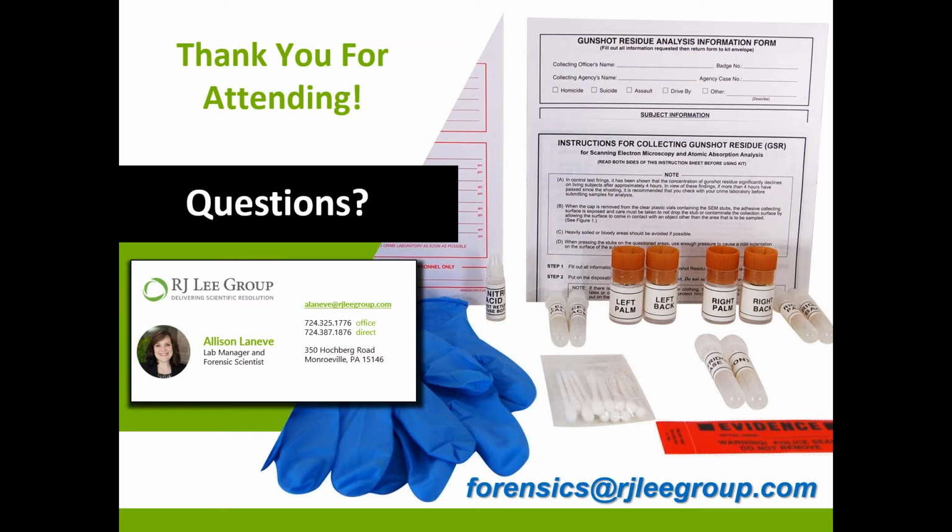What would be the proper procedure for collecting a GSR, then DNA swab from a steering wheel, for example? And would it be a stub for GSR and then swab for touch DNA?